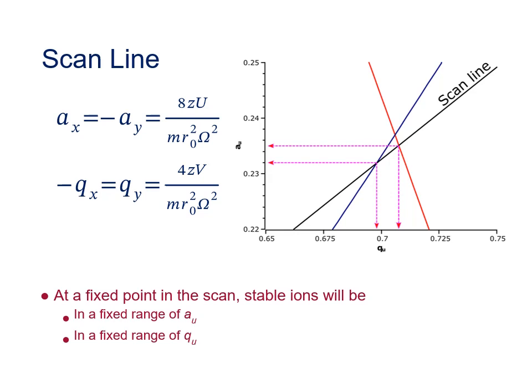And in the same way that we could use rearrangements of the Mathieu equations to help us calculate the low mass cutoff in quadrupoles, we can do the same approach here in order to calculate the mass range that's within the stable region at any given time. We could actually do this calculation with either the A or the Q Mathieu equation, but as we used the Q1 for the low mass cutoff, we'll use the A1 for this task.